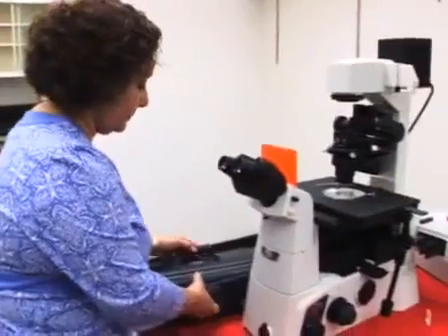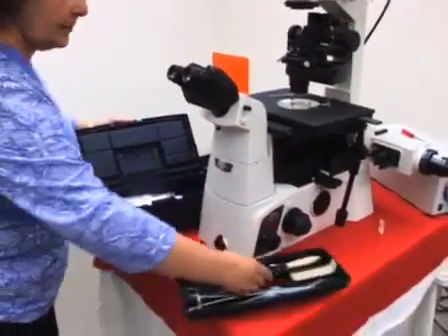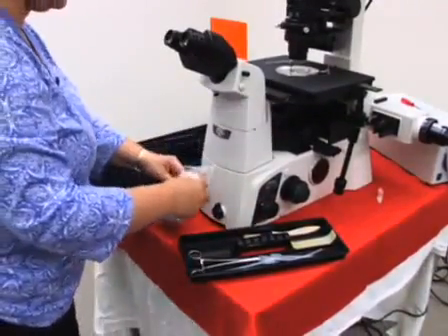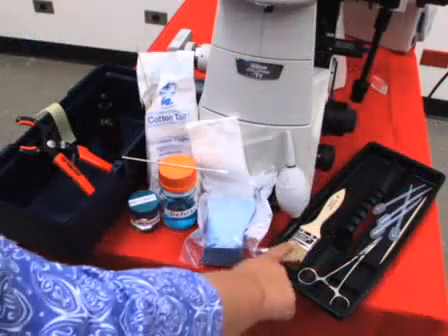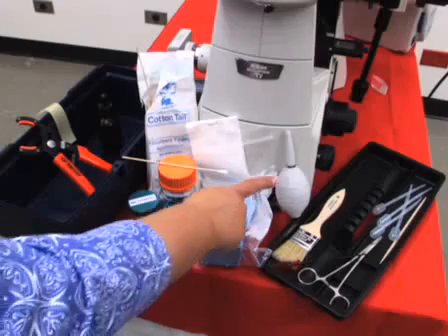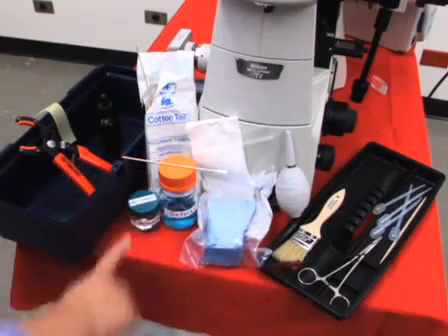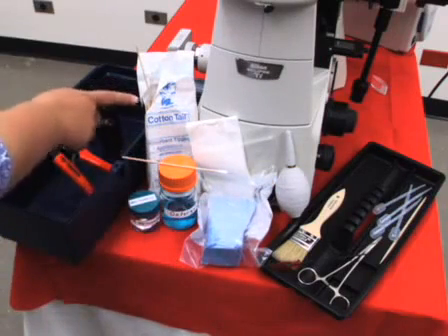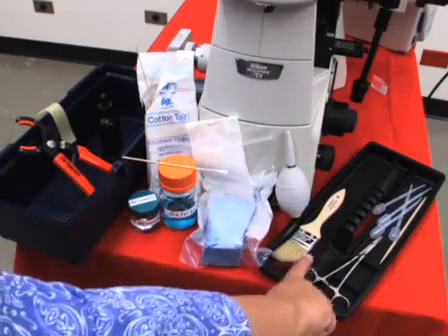If optical components do become dusty or coated with oil residue, it is important to clean them carefully. It is advisable to have a tool kit located near the microscope with commonly used cleaning supplies. Minimally, the kit should contain a soft brush and a puffer to gently remove particles, lens paper, optical wipes, and cleaning solutions. Other items to include might be swabs, rubber grippers, and small tools for the microscope.